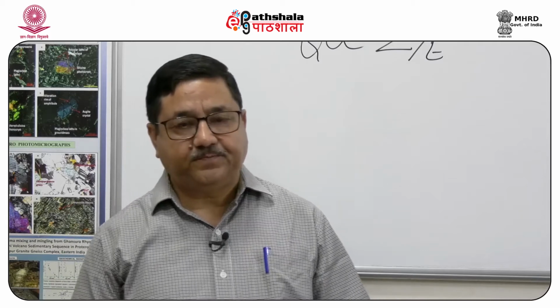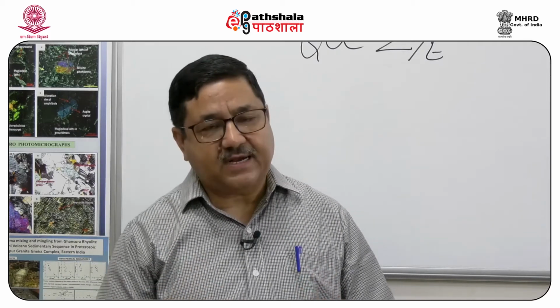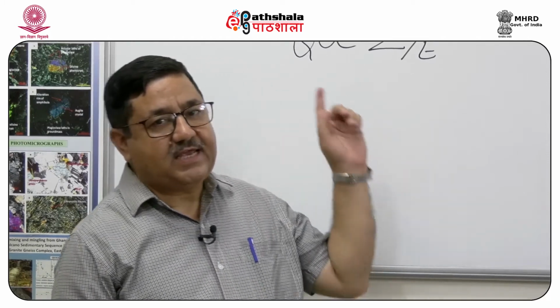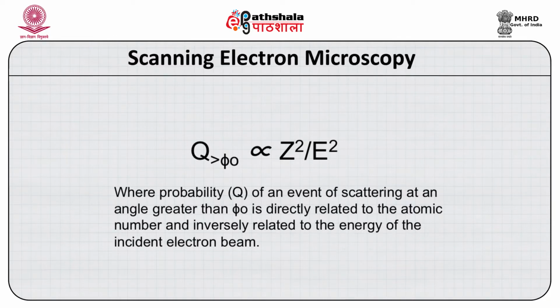So, therefore, the interaction of the electron beam with matter can be best described as a probabilistic event. So, the probability of an elastic scattering is expressed in this form, where E is the energy, Z is the atomic number of the material with which the electron beam is interacting, and Q refers to the probability of an event occurring.